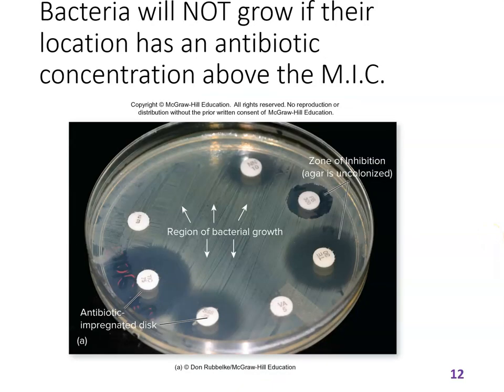This is what it would actually look like in a laboratory. You'd have a much nicer pattern, or you'd use a liquid to evenly coat the plate with bacteria before you incubate them. But either way, you'd see these nice circular zones of inhibition. And what you're seeing is bacteria grew here. They did not grow here.